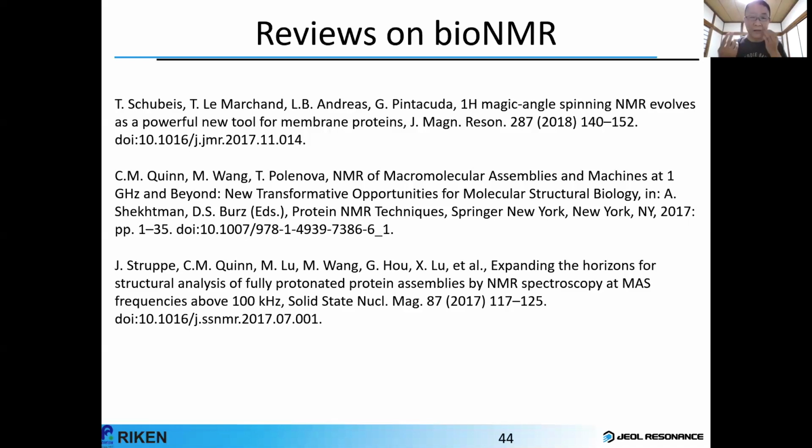Another way is that we can compare the NMR spectra for nitrogen-15 and nitrogen-14. But anyway, we need two independent experiments to obtain the size of the quadrupolar coupling. This is one of the limitations. But still, I believe proton detection is better than direct detection.